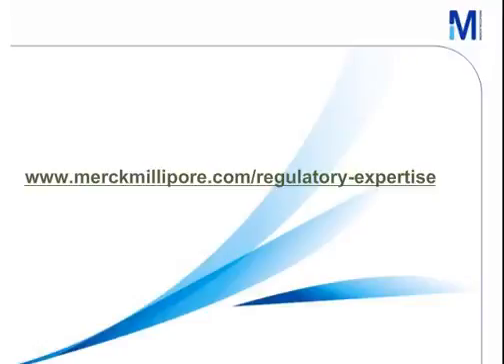We have to say that in 11133, in the new standard for the quantitative testing, this is given as a citation in the bibliography, but it is not completely the same. We tried to simplify it a little bit, so that for quantified quality control, the surface technique can be used and not a special streaking technique.